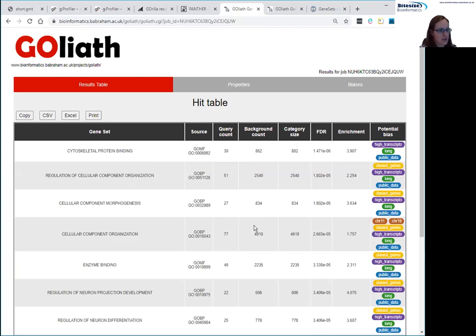So this was a bit of an extreme example. The 200 genes that I ran through this analysis all have a very high number of transcripts, splice variants. So a lot of them are long. And so some were also in the set of genes that were closest to random positions in the genome. And some of the categories here were also identified when analysing the public RNA-seq data.